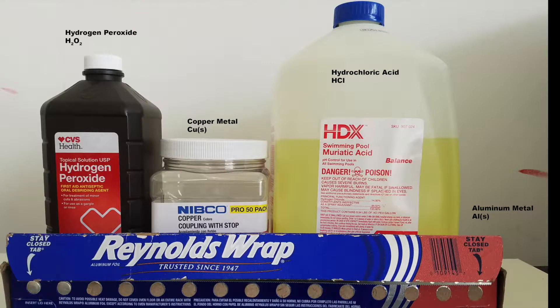To create a copper chloride solution, I used standard 3% hydrogen peroxide and hydrochloric acid. I found the hydrochloric acid at a hardware store that was in the form of a pH control solution for pools.